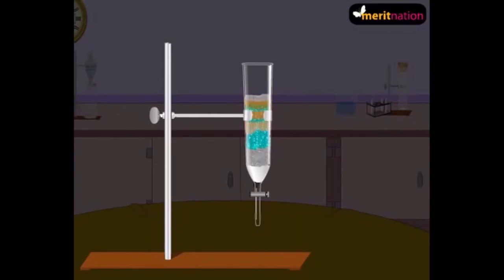The mixture to be separated is now dissolved in a highly polar solvent, which could be for example alcohol, and is introduced into the column. After some time, the components of the mixture separate and form thin bands. The component that is more weakly adsorbed will move faster through the column and therefore will get separated first. And the component which is most strongly adsorbed will get separated last.